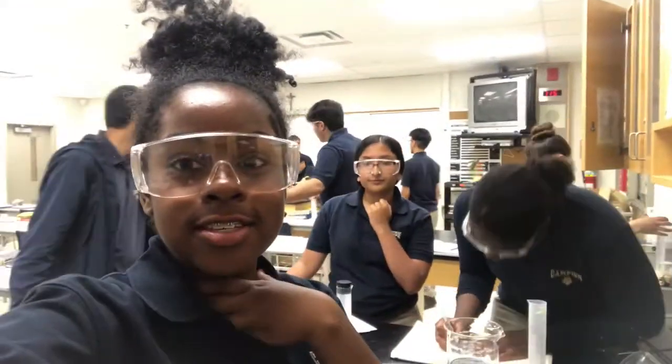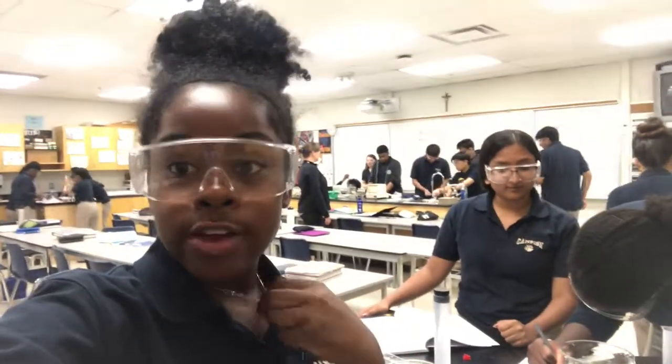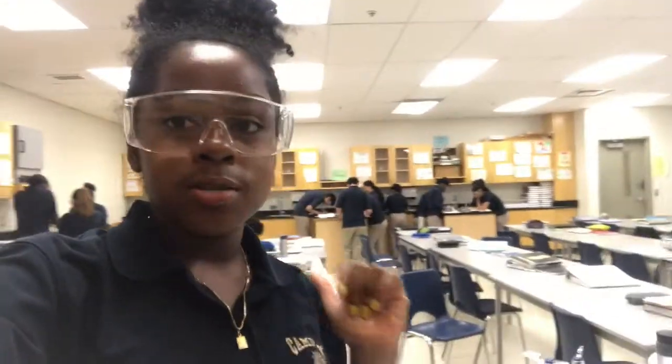We're on our last lab vlog of the year, guys. It's CPT lab time. Our CPT is the production of hydrogen gas. So what we're doing right now is we have our 1 liter beaker of water right here, and we're gonna collect some HCl and we're gonna add magnesium to it.